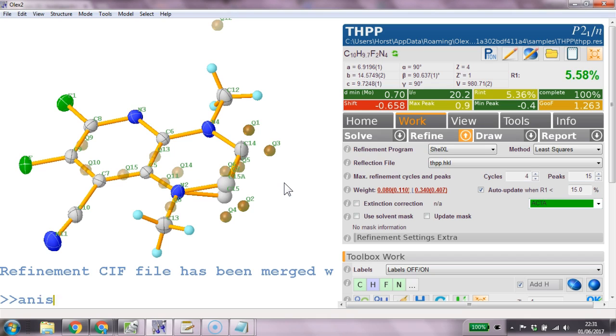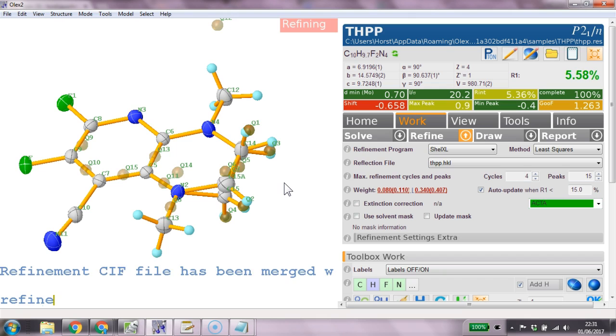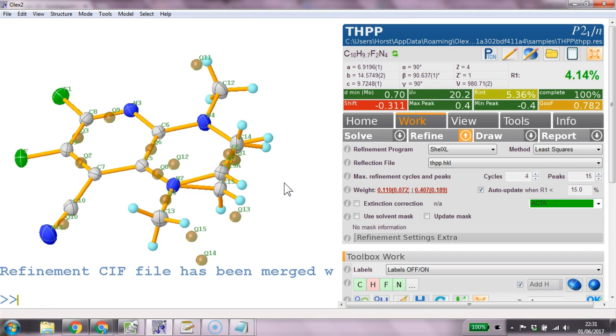We go anisotropic on this and age add and refine. And that should refine the whole thing and it does.